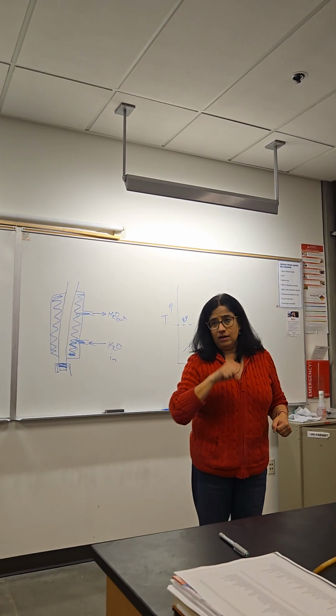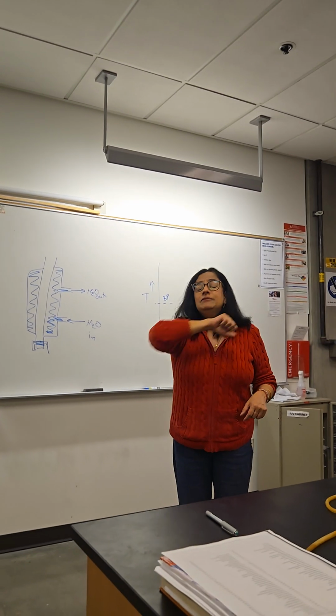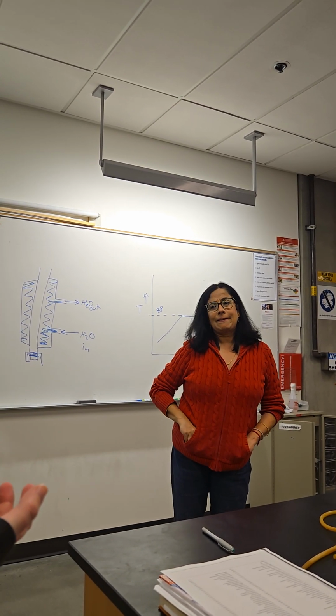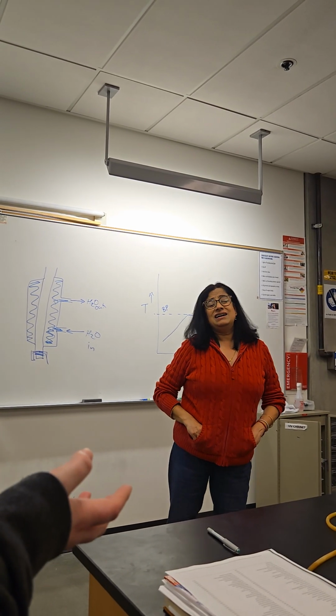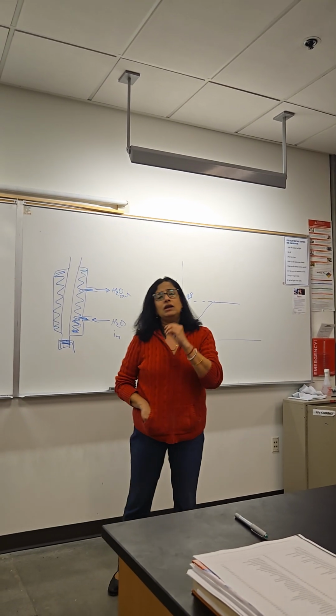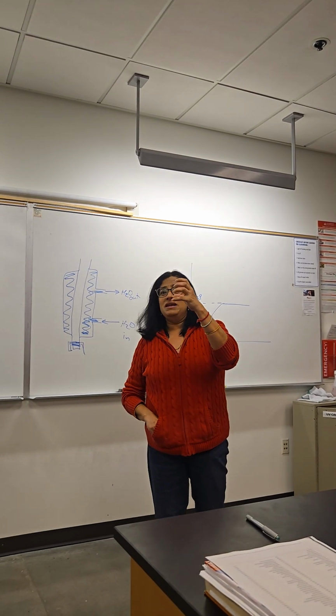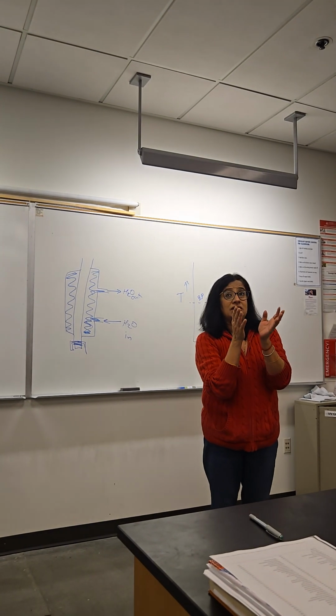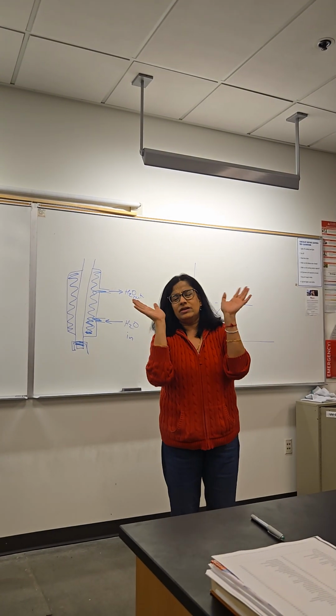When I was reading the textbook, it did say that it will level out. Yeah. So you want to leave it for anywhere from 2 to 3 or 4 to 5 minutes, but that depends. For us, it may not be that much because we have a small amount of liquid. So don't go by minutes.